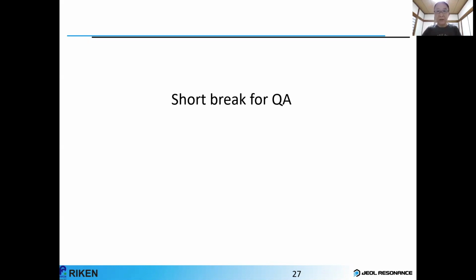So in this sense, of course it depends on the sample, but if your sample has proton close to the chloride, fast MAS is still a good option for chloride measurement. Of course, we can try wurst excitation or something else. That depends on the sample. But fast MAS is still one good option for these experiments.